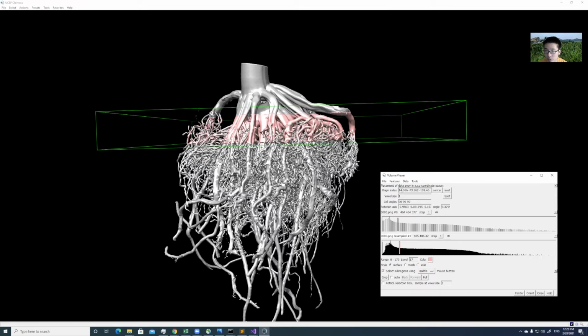So at the top of the volume viewer, we have the origin index, which is basically saying where the origin of this soil plane volume is, so kind of the top left corner of the soil plane. And then it also has the rotation parameters. So you can see that here's the rotation axis, and here is the angle in degrees that you would rotate around that rotation axis. How you can interpret this is, with respect to the original volume, we're basically rotating around the original volume by this amount, and then offsetting by this amount, the origin index.